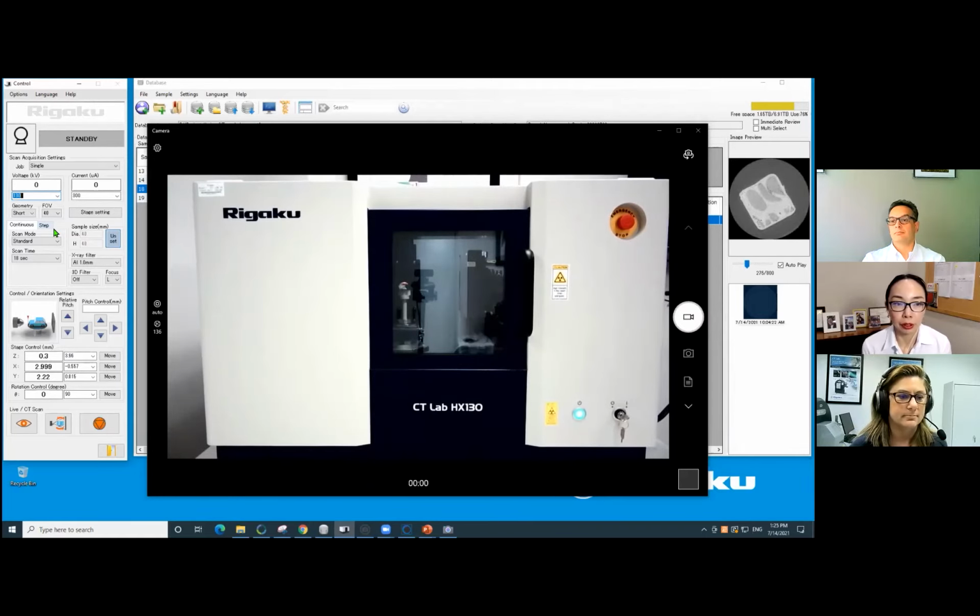And obviously, we're looking for something that does not absorb X-rays a lot when you're mounting a sample. But it's good to have a good idea of which one absorbs more or less. Right. Okay. And the key thing is you want it to absorb less than your actual sample for sure. Right, it's relative in that sense too. Yeah. But always good to know and to characterize your mount materials before you use them.